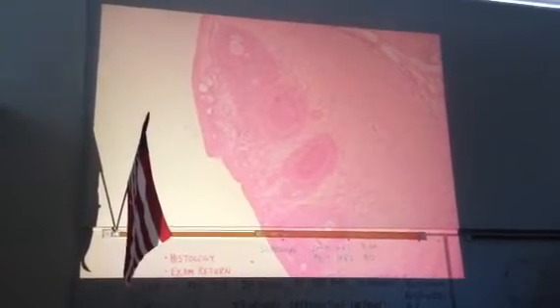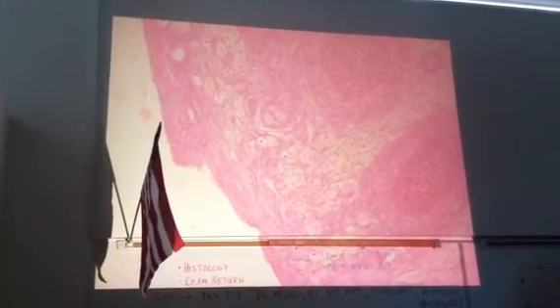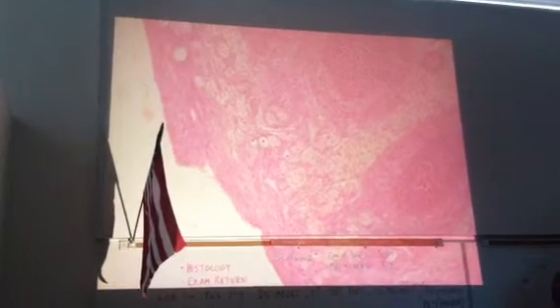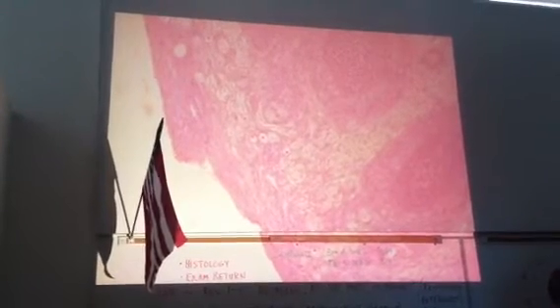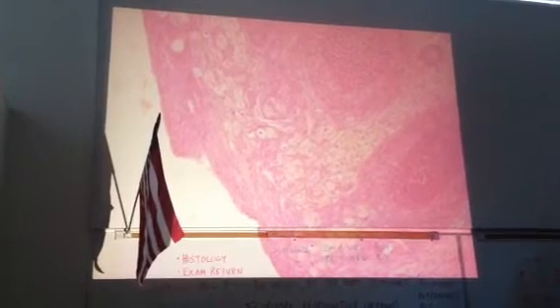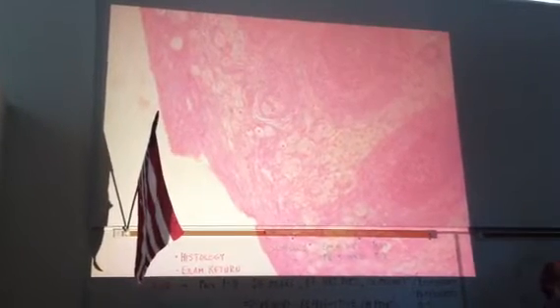As we look at them here, it looks like a little black dot with a white circle around it. And we have several right over here. So that's the primordial follicle. Bringing this in line with the development in the human female, monthly after she's passed through puberty, she's going to start about 30 to 35 of these towards maturation, although she typically only is going to ovulate one. You start a great number towards maturation because they have to make a hormone to get the whole process going, and one doesn't make enough hormone.